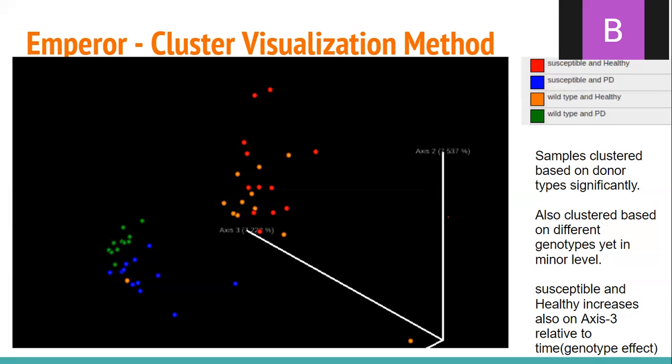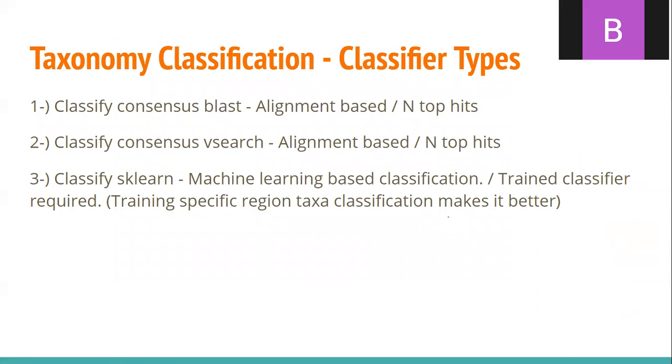Okay, after we obtained the core metrics results, we clustered our samples and looked for their diversity values. Now it is time for what we are looking for exactly. To do this, we classified every sequence variant in the microbiome that has been found, by taxonomic classification. We are going to name our features actually.